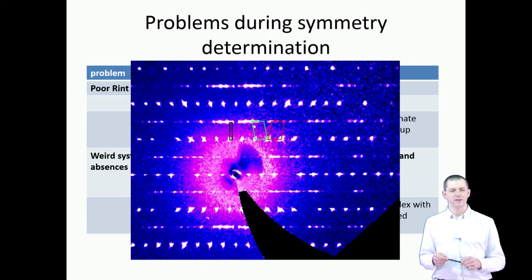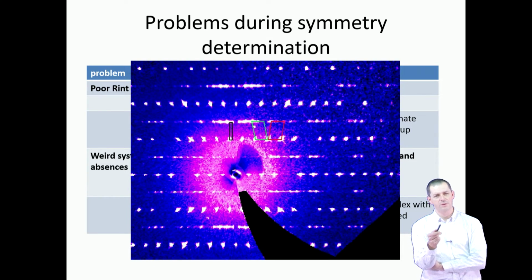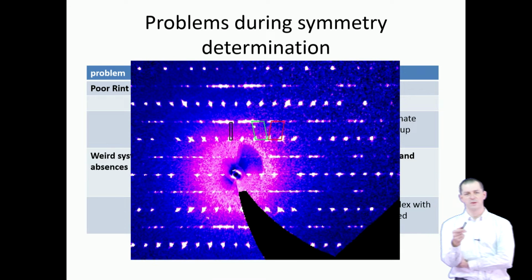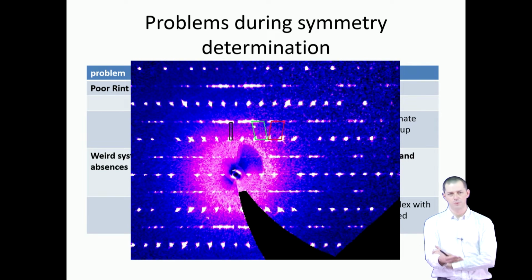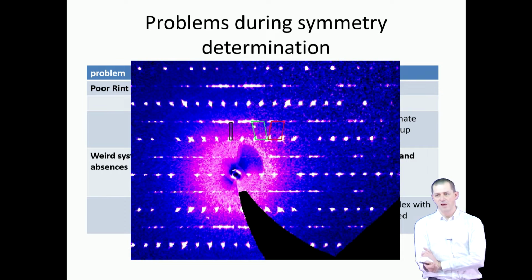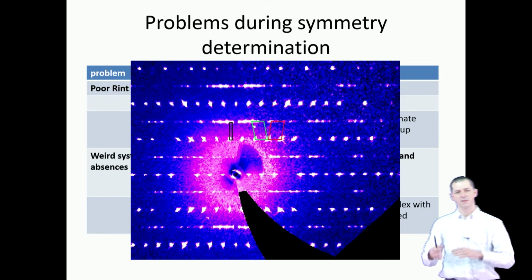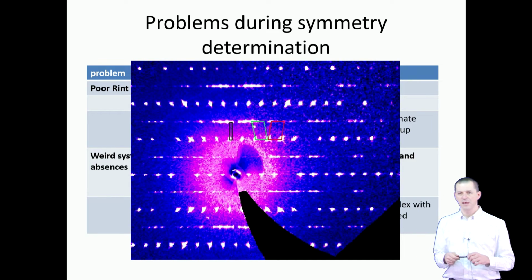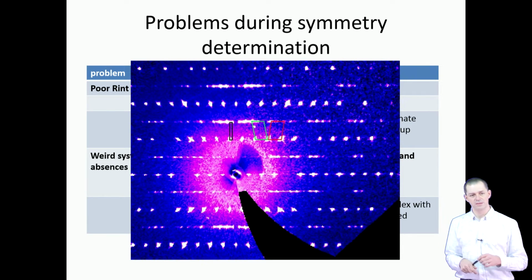We had an interesting case now with one of your colleagues. Can you remind me of the composition of that material with these funny systematic absences? Yeah, nickel-3 indium antimony. Very simple structure, hexagonal. We looked at the reciprocal space sections and we found very unusual systematic absences. So at first glance, I was convinced this is a sign of twinning, of this sort of twinning. But then when we wrote out the distribution of the apparent systematic absences, it was not possible to find a combination of 2 or 3 lattices that would explain these systematic absences.